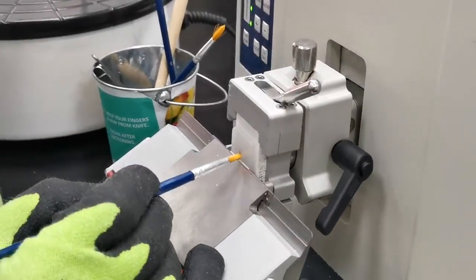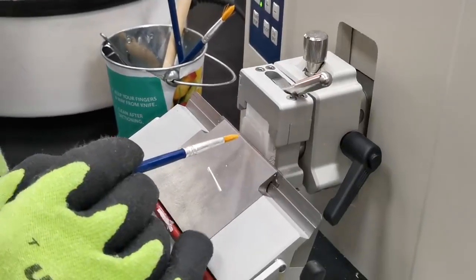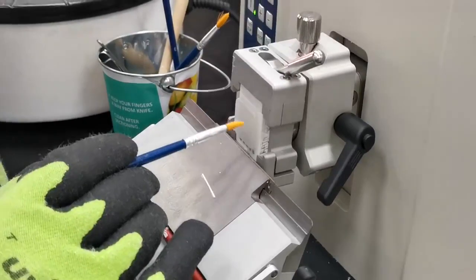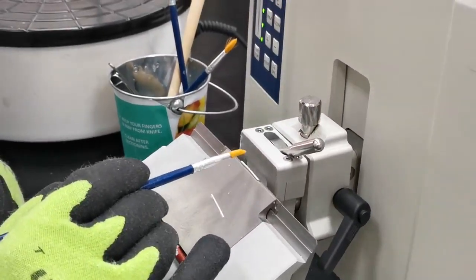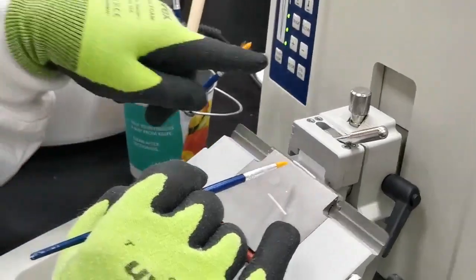With slow-mode cutting, we can see it's only cutting from the lower part of the block. I need to do a little bit of alignment to make it cut from the full surface, so I'll stop the cutting.